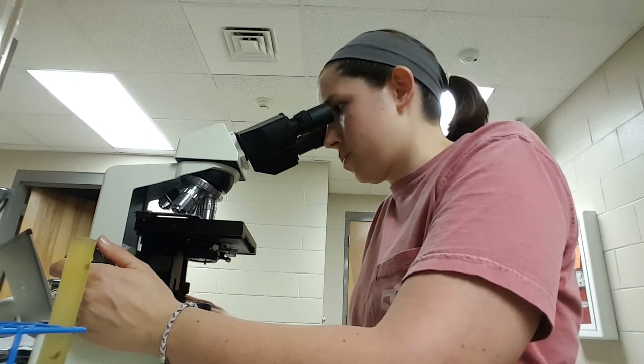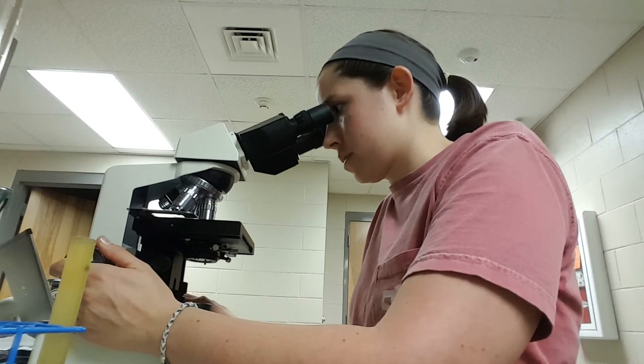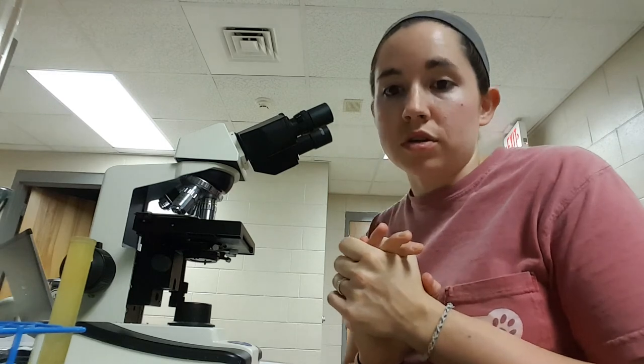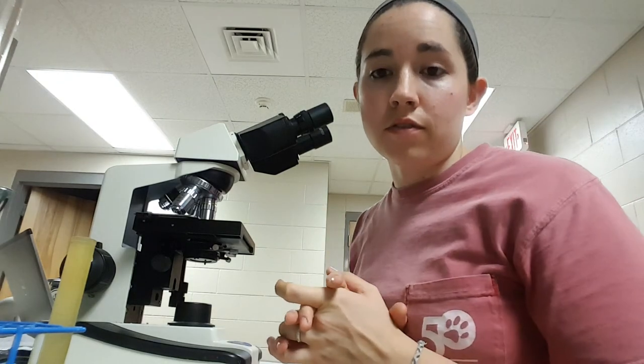Just a little bit more on this one. All right, so we definitely have a roundworm, so I'll be sure to make a note of that in the record for this patient so we can get that taken care of.